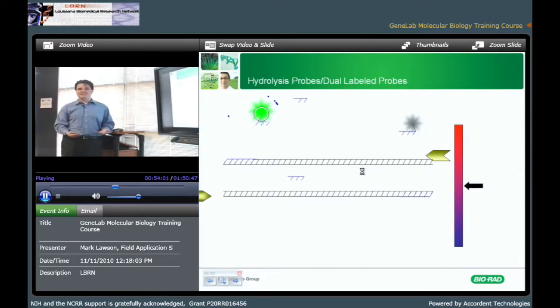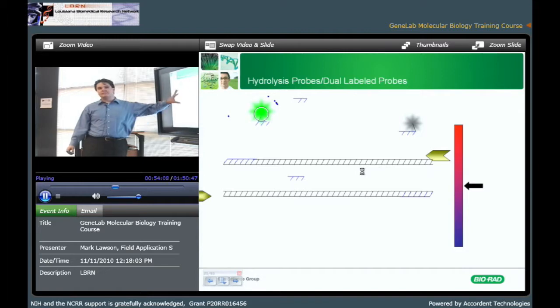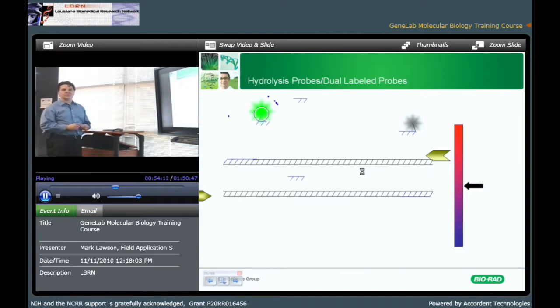If you make a product at 68 degrees, then you know that your primers are binding. And if that's happening, then these primers are incompatible with that probe. And this is something that people often have to go through, even with commercial assays. Right? Usually the company hasn't completely worked all the bugs out of the kits before they sell them.